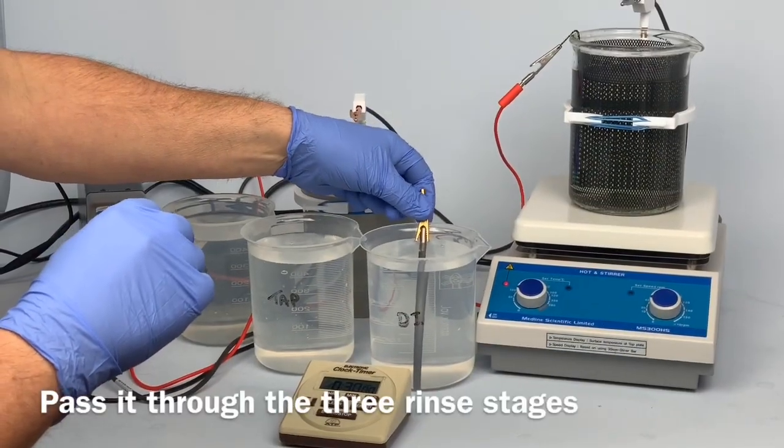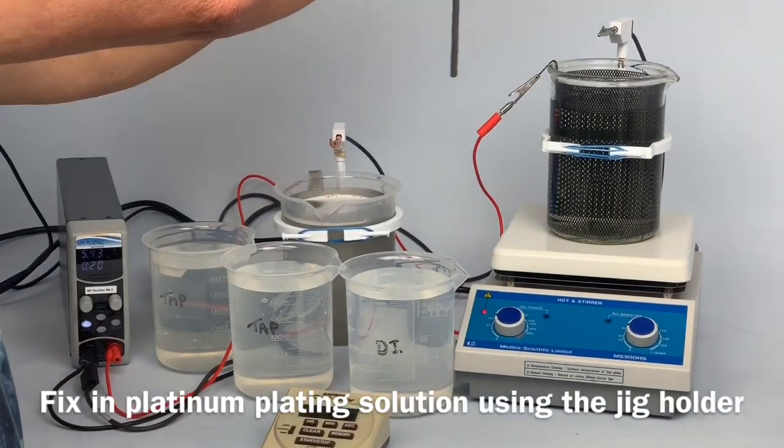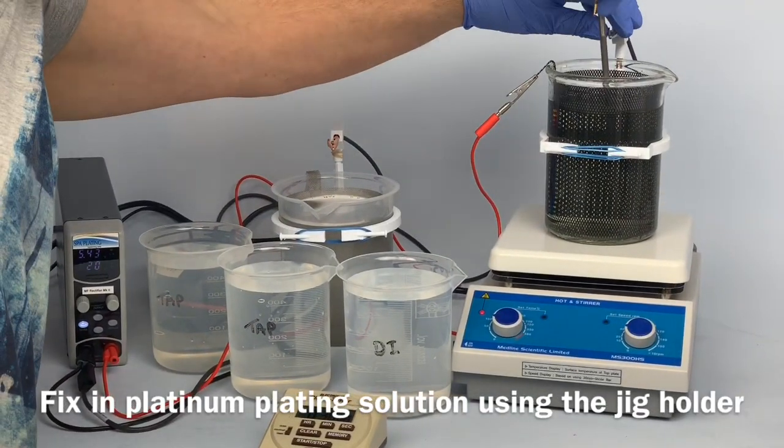Pass it through the three rinse stages and then fix it in the platinum tank plating solution using the jig holder.